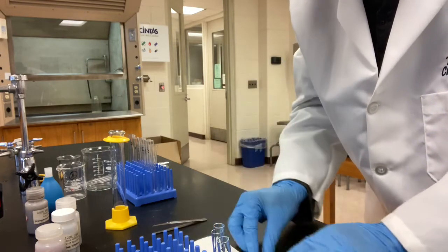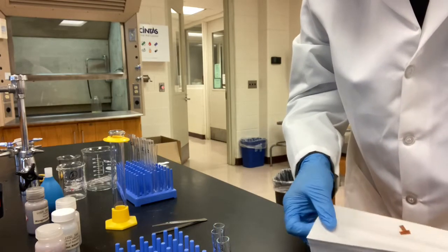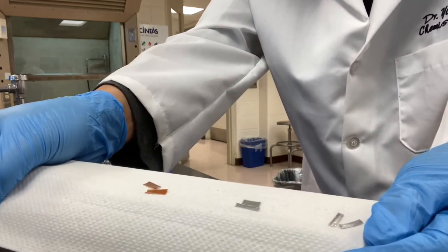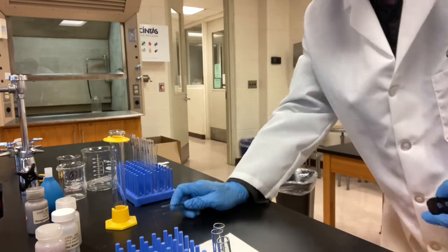I have 3 metal pieces: magnesium, zinc, and copper. I'm going to put them in and let you observe which one reacts faster.